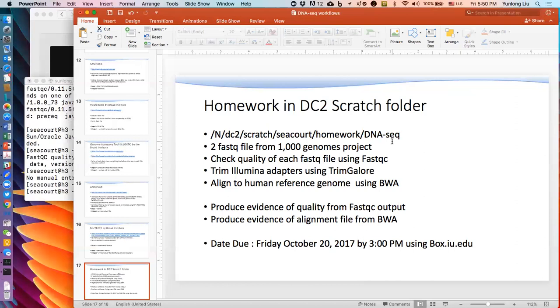Aligning, as you have seen through Dr. Liu's lectures, it's tricky, okay? So if you guys haven't run the Burrows-Wheeler aligner before, you're going to have to read some documentation. You're going to have to think about how to set this up to successfully navigate the commands. I'm not taking you all the way down through the VCF file for the simple fact that it's 96 hours of computation. It puts a heavy burden with 25 students on the system generating data all the way down to a VCF. If anything goes wrong, you may or may not be at a point where you're comfortable addressing it and fixing it. And it also puts a queue of 25 more people in line to use the server.